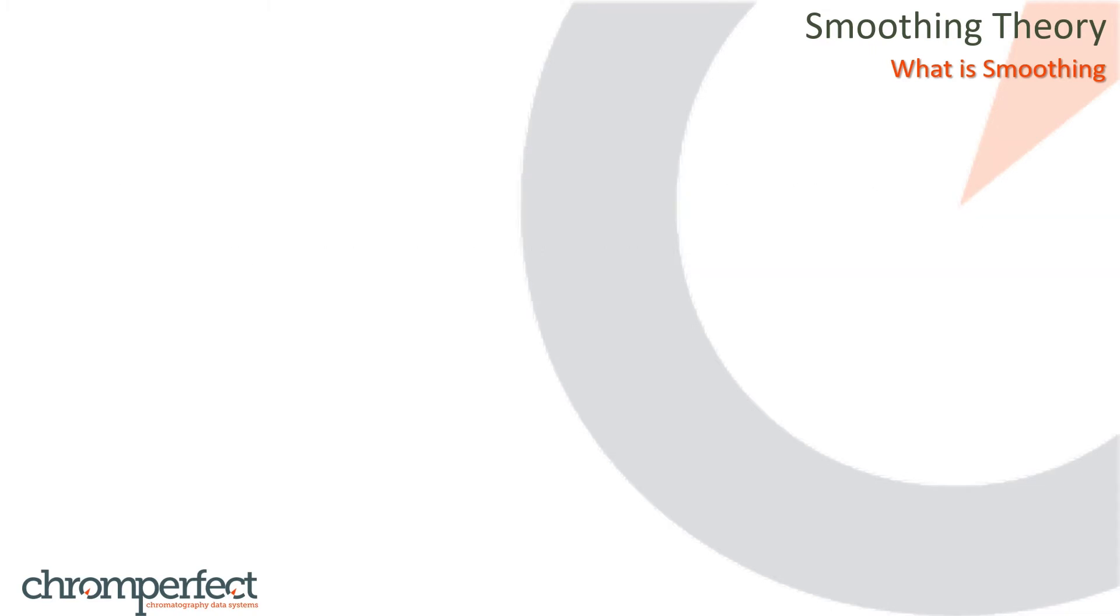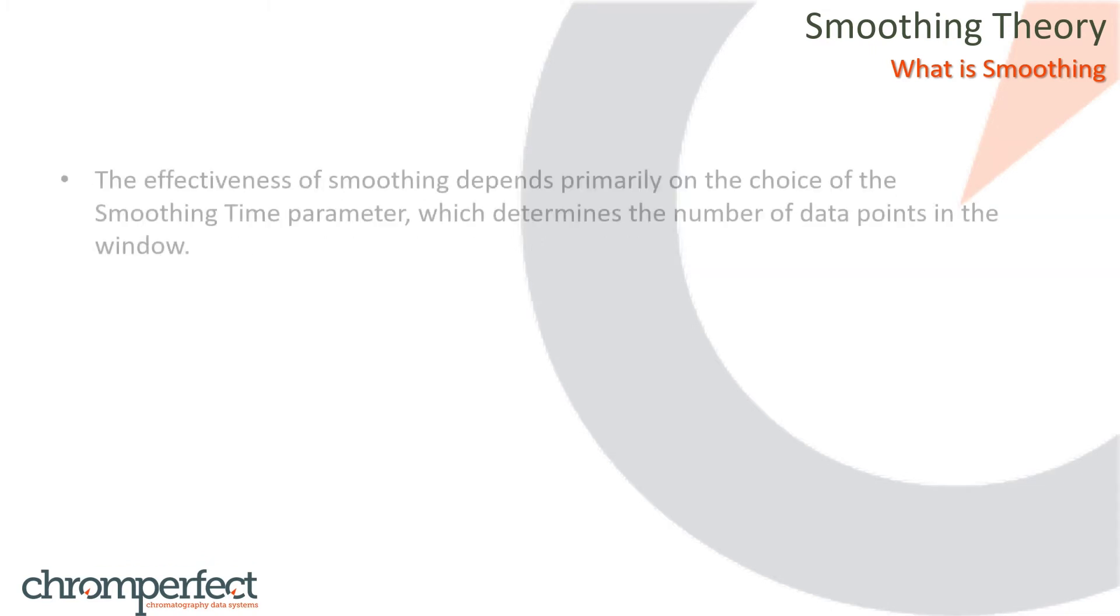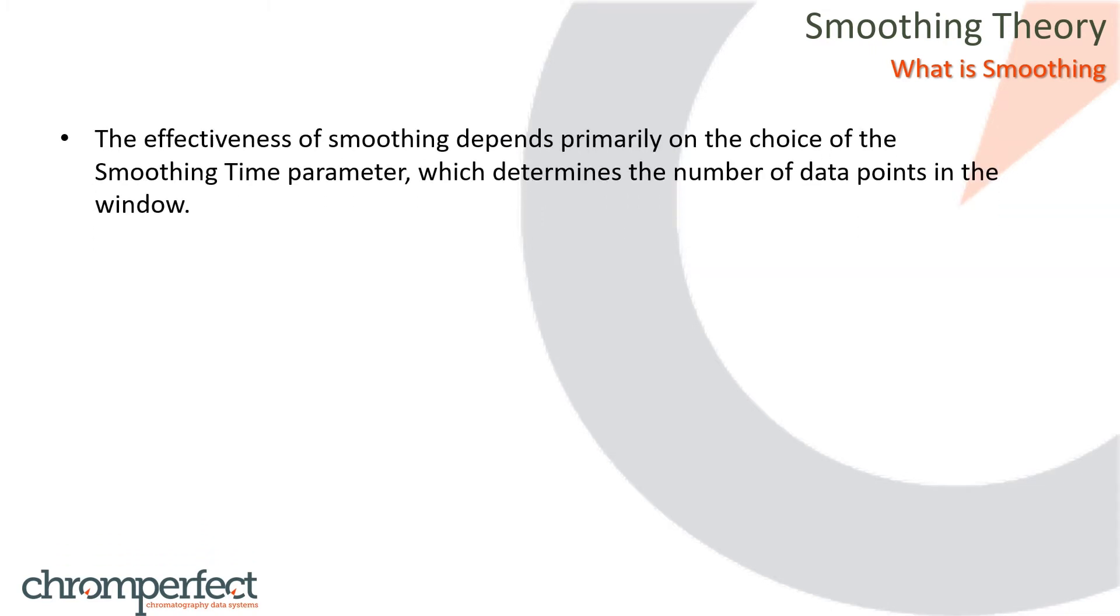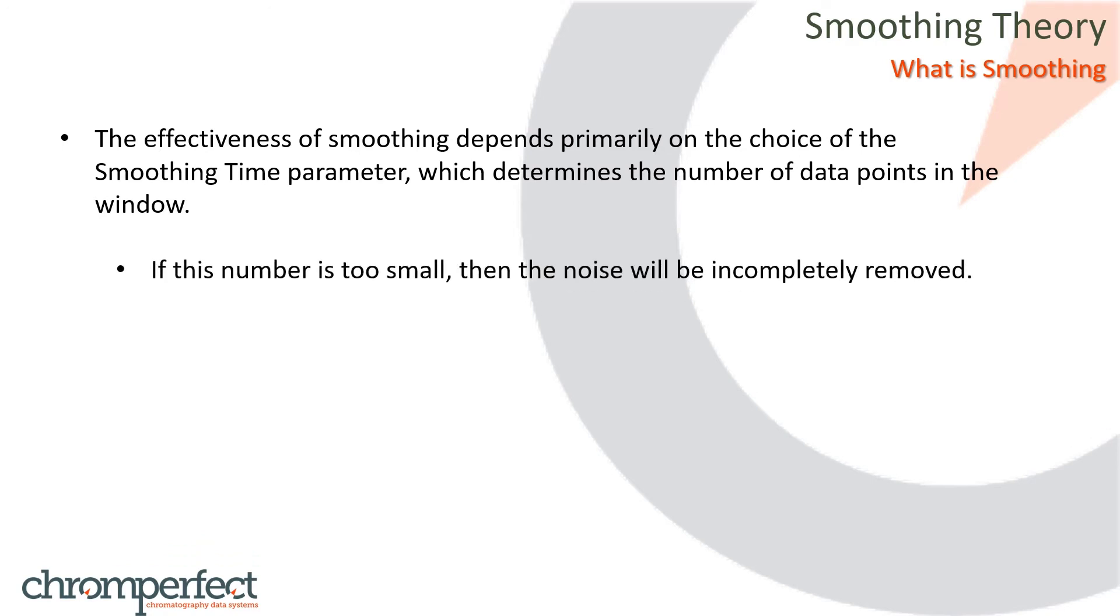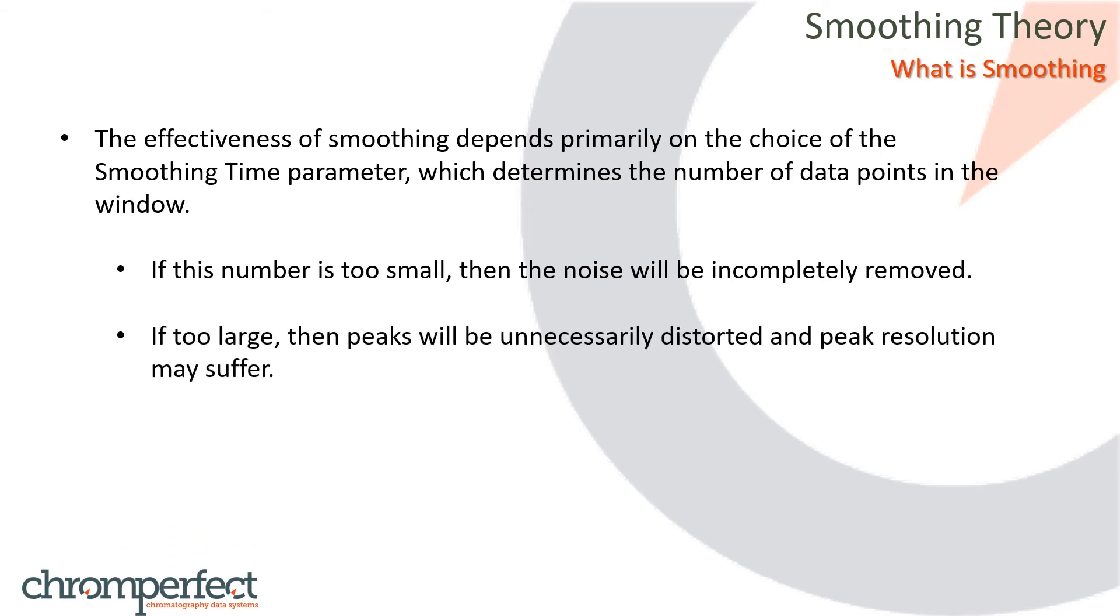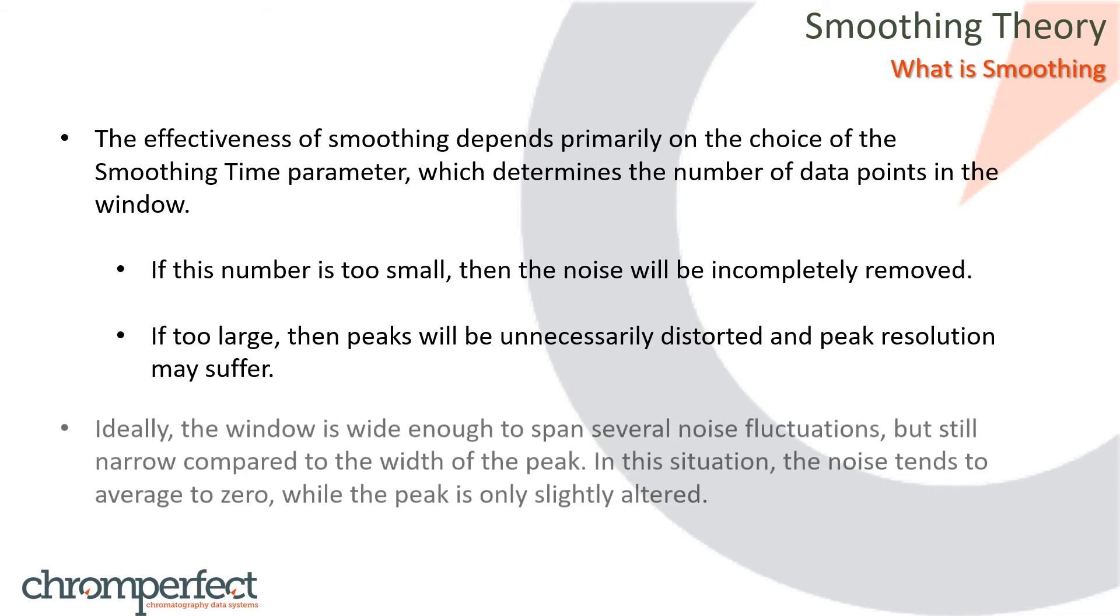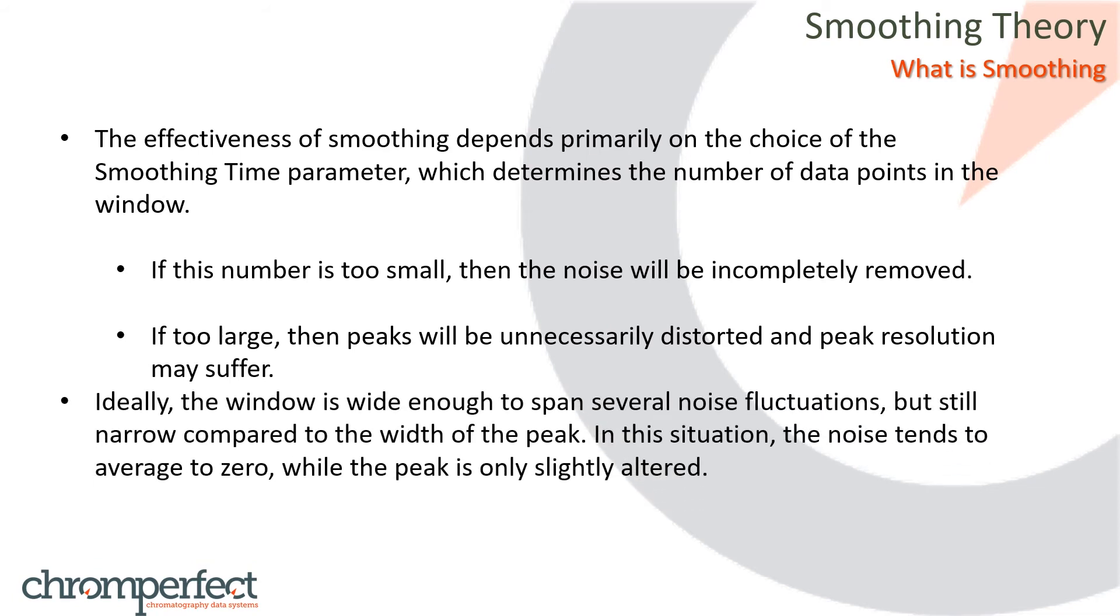With any of these smoothing algorithms, the effectiveness of smoothing depends primarily on the choice of the smoothing time parameter, which determines the number of data points in the window. If this number is too small, then the noise will be incompletely removed. If too large, then peaks will be unnecessarily distorted and peak resolution may suffer. Ideally, the window is wide enough to span several noise fluctuations, but still narrow compared to the width of the peak. In this situation, the noise tends to average to zero, while the peak is only slightly altered.